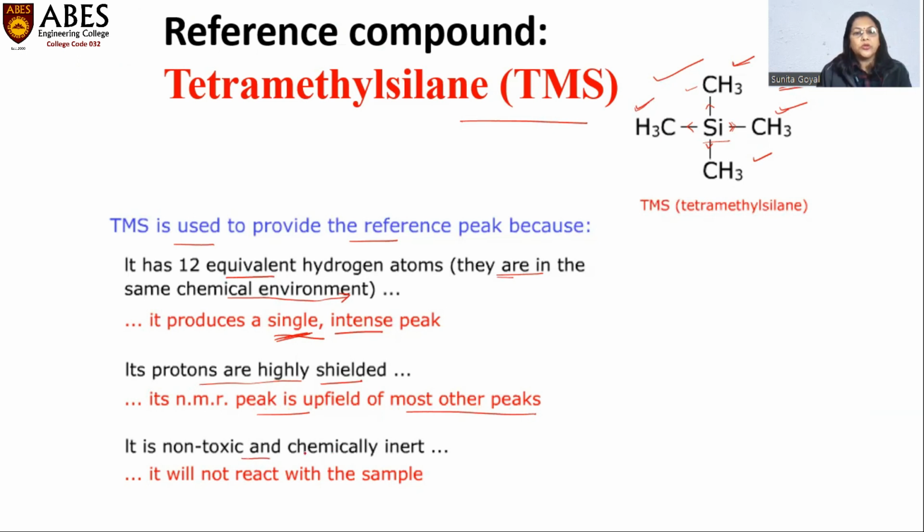Then it is non-toxic and chemically inert, therefore it will not react with our sample and we can retain our sample very well. Moreover, its boiling point is very low, therefore it can be volatilized very easily and our sample can be retained.